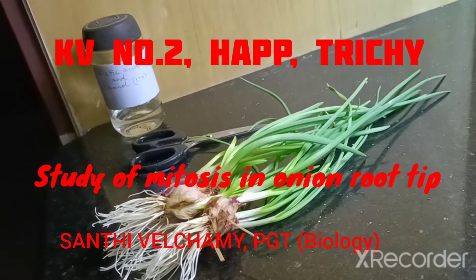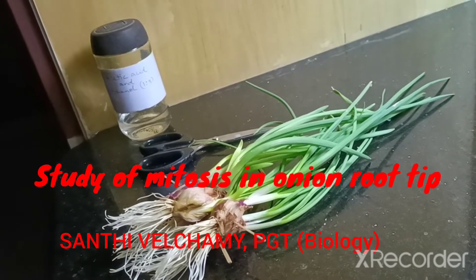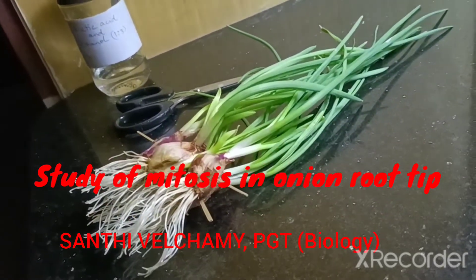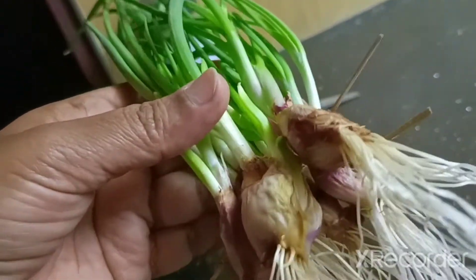Hello children. Today we are going to prepare a temporary aceto-carmine stained mount of onion root tip to study various stages of mitosis. For that purpose, I have taken an onion bulb.